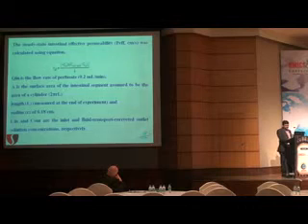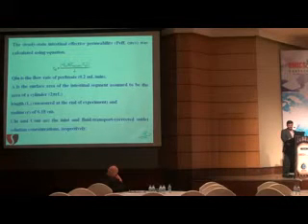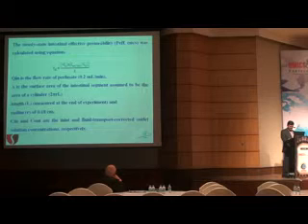So the outlet tubing was placed around 10 to 15 centimeters above the first opening, and a blank perfusion with phosphate buffer saline, pH 7.4, was infused for 15 minutes by the syringe pump, followed by perfusion of the compounds, that is pure exemestane and also the 1:9 ratio of solid dispersion. Samples were collected every 15 minutes for 90 minutes, and the samples obtained were analyzed by HPLC.